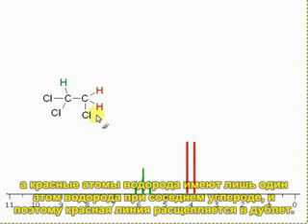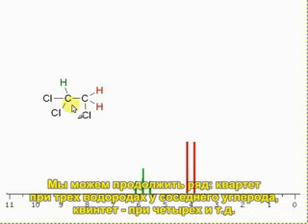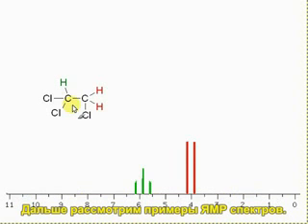And for the red hydrogens, there was only one hydrogen on the neighbouring carbon, the green one, and so this red line is split into a doublet. The effect can continue so that you can have quartets with 3 hydrogens on neighbouring carbons, or quintets, or even more. Next, I'll go through some examples of NMR spectra.